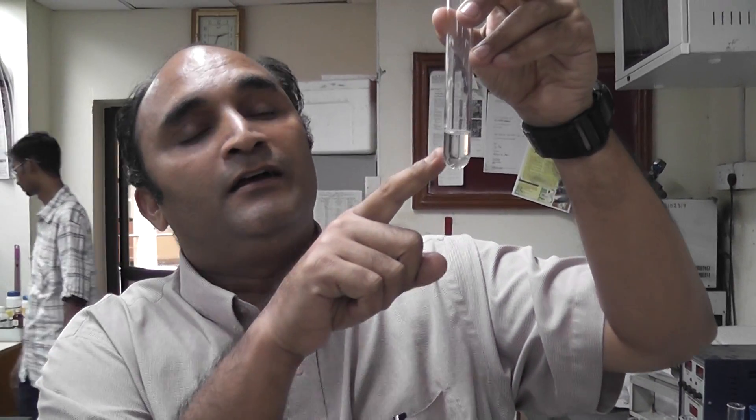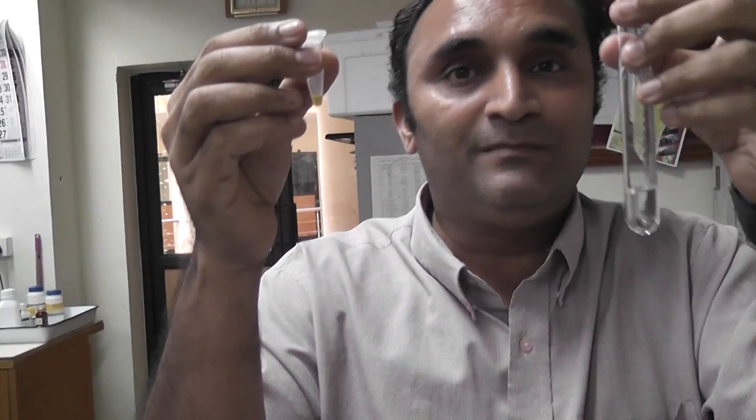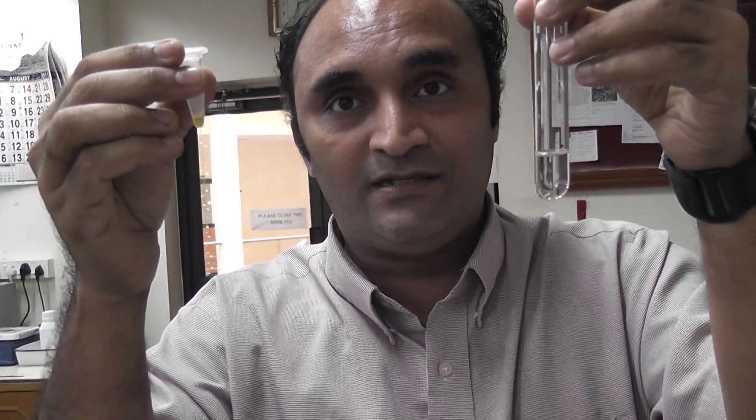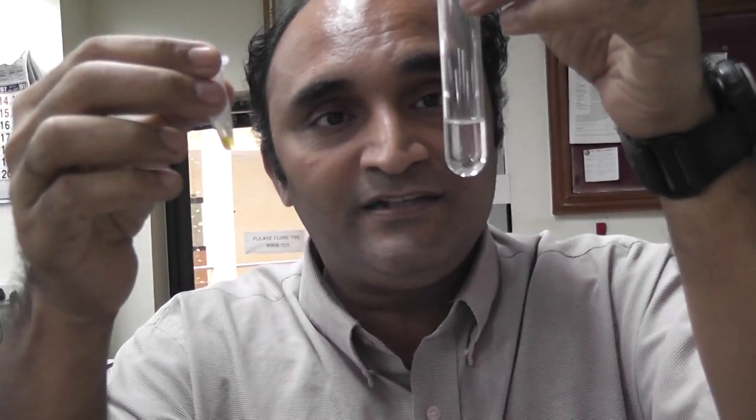This is a simple experiment. Here we are using a Crocin tablet dissolved in double deionized water. We use this solution to help in synthesizing gold nanoparticles. Obviously we need the gold salt — without gold salt we won't be able to synthesize the gold nanoparticles. But we use this Crocin solution to help in synthesizing the gold nanoparticles.